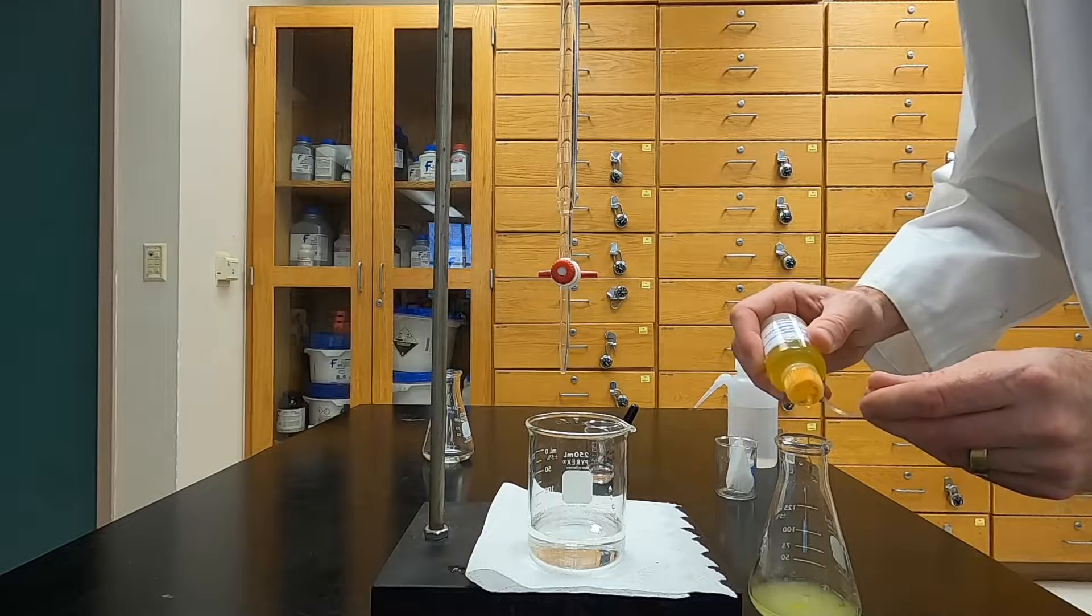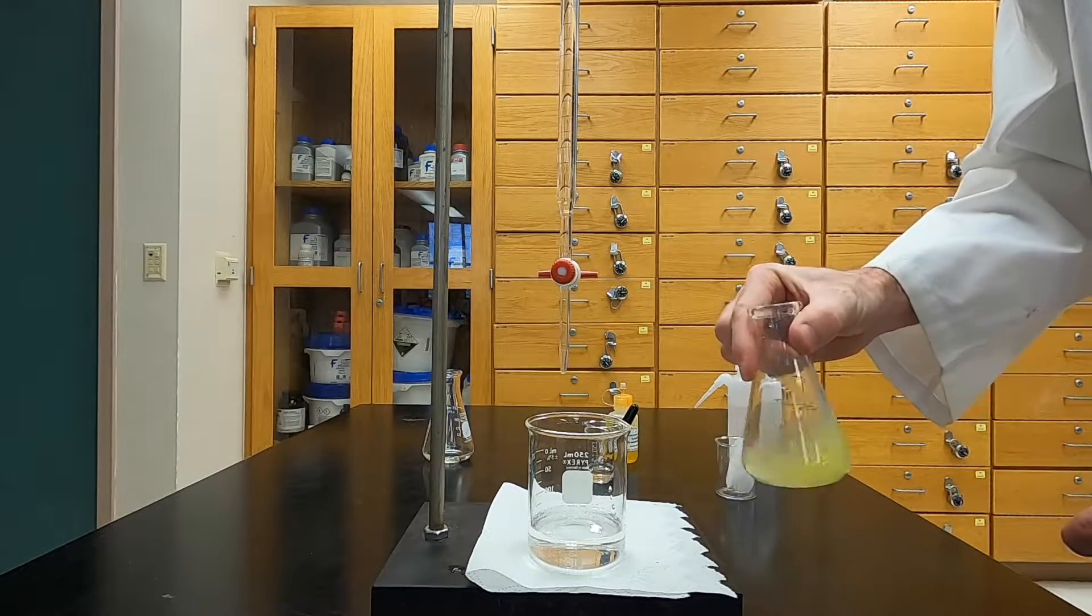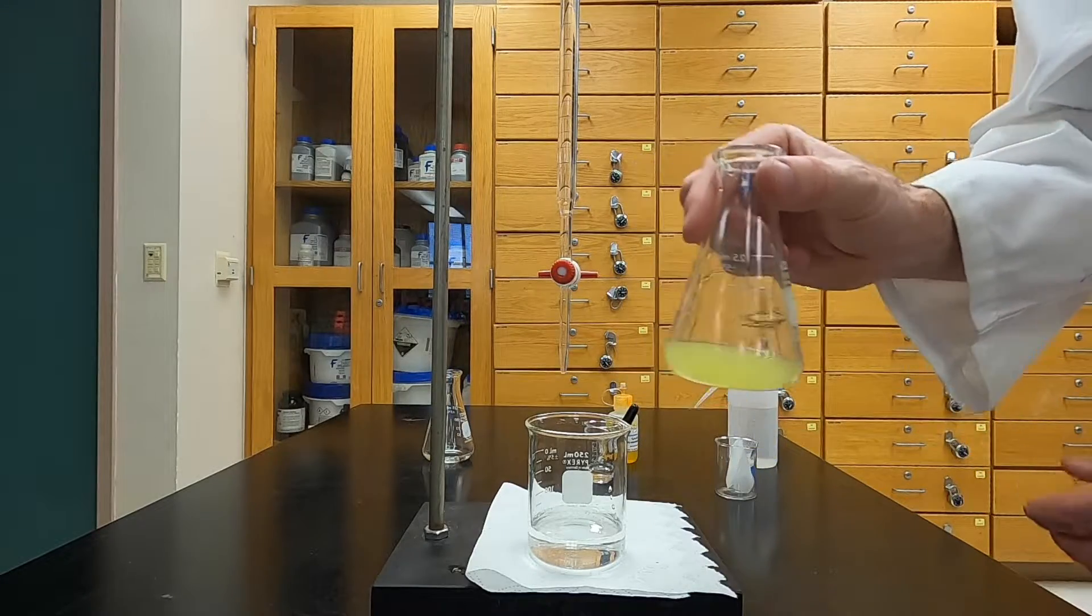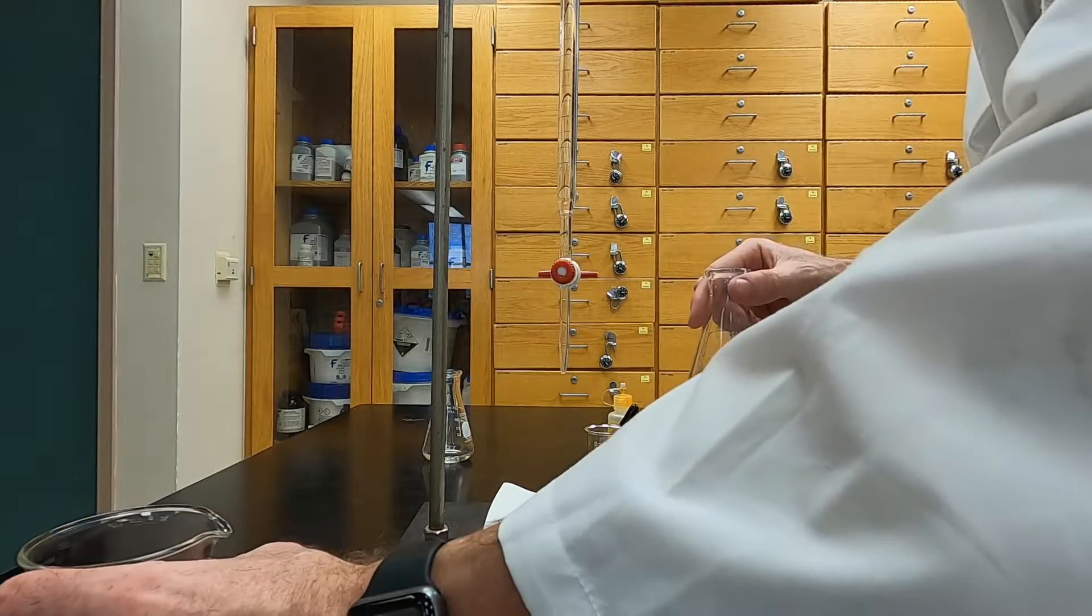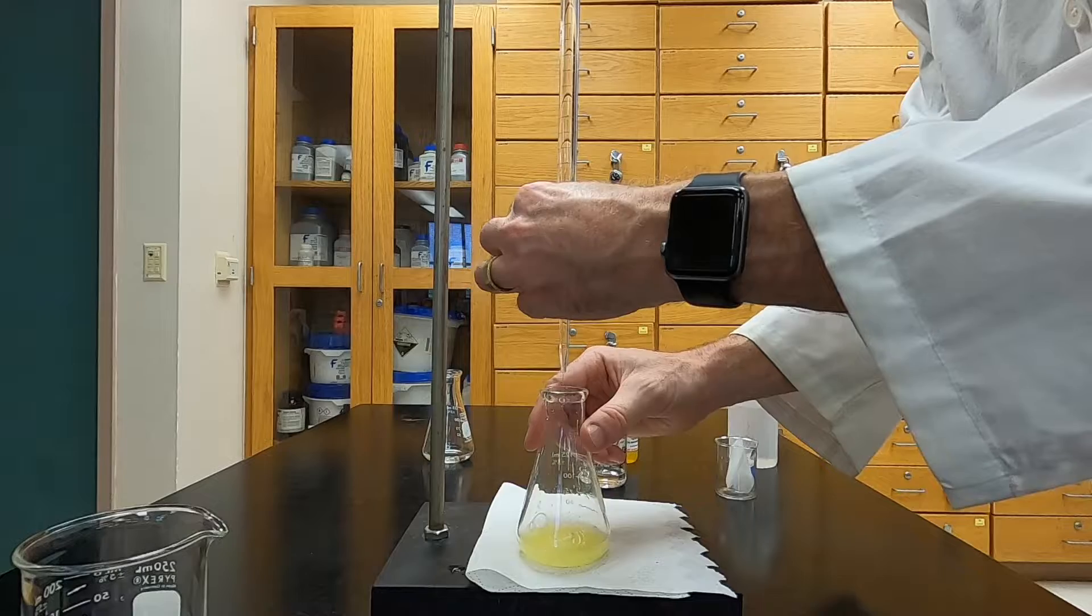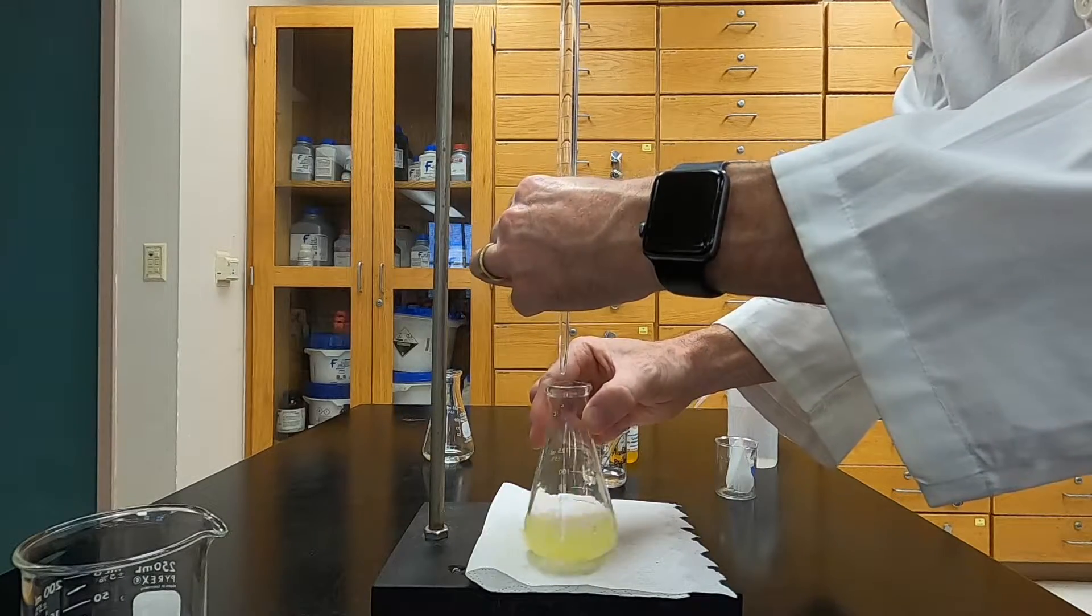Finally, you'll add some of the dichlorofluorescene indicator to the solution. We're adding the indicator now before we even start doing the titration, but once you know roughly the endpoint of your titration, you'll want to add the indicator closer to that endpoint. This helps ensure you get a crisp endpoint and don't reduce too much of the silver due to the photoreactive nature of it.